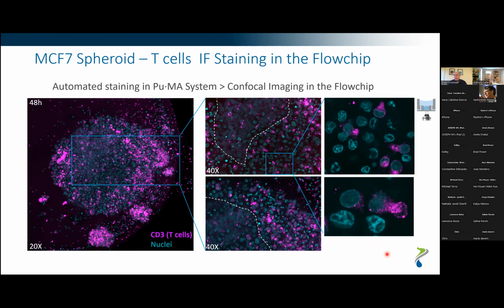And so very excited about this. And again, being able to follow this on a cell-by-cell basis is, I think, very exciting, and being able to use this as a tool to help guide therapeutic development. And ultimately, if you can take a patient biopsy with the patient's immune cells, and then as a clinician be able to use a tool like this to say, okay, here are the different immunotherapy regimens available to you. These are the ones that are going to work best for you. Or to see immune resistance and watch over time as that patient's tumor cells develop resistance to different immunotherapies. And so very excited about where this is going.